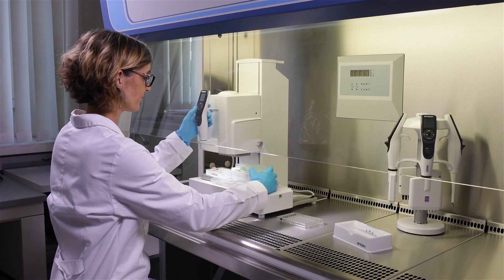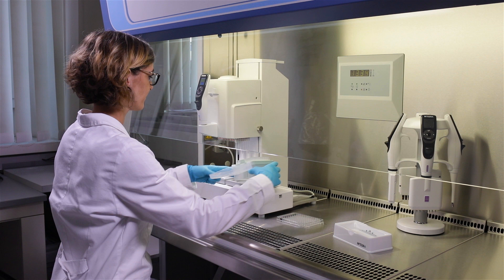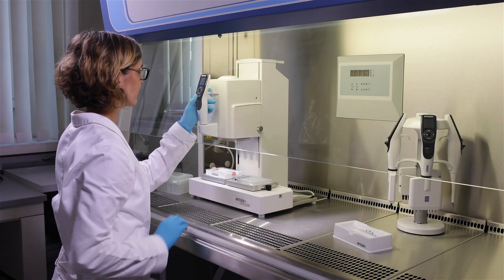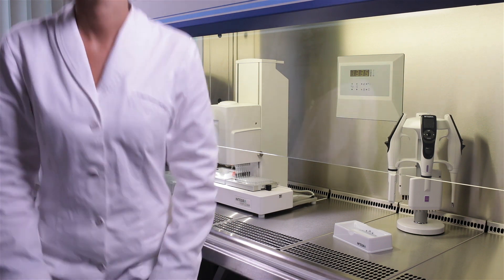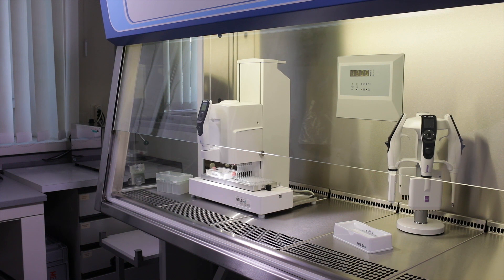Even serial dilutions can also be performed by simply partially loading the tips. In addition, you could even automate your pipetting tasks. This is especially useful in space-restricted conditions, or to ensure a process is always carried out the same way.